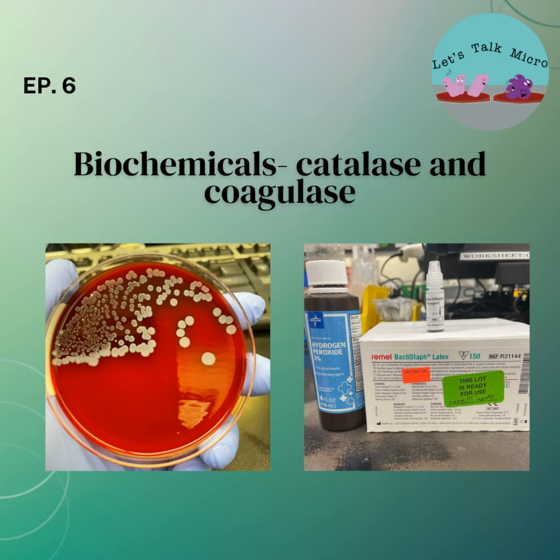But keep in mind that if you have white colonies in young females, like on the urine bench, you need to do an ID to rule out Staph saprophyticus, which causes UTIs in young females. If you have beta hemolytic, coagulase negative, still do an ID to rule out Staph lugdunensis, because it's pathogenic.